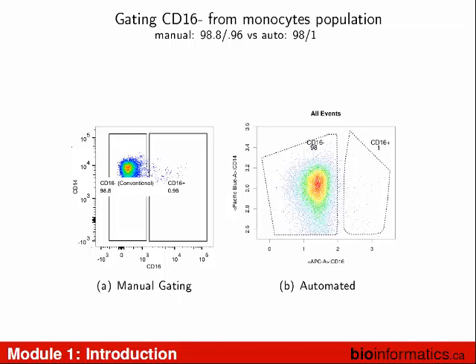There's no reason why the line is here versus here versus here. There's no math that says this is the cut that has to be made. There's nothing in the density distribution that says that's where it's going to be. You, as a biologist, say this is where the line is, and this is where it always has been, and this is where it always shall be. That's your way to make a diagnosis.